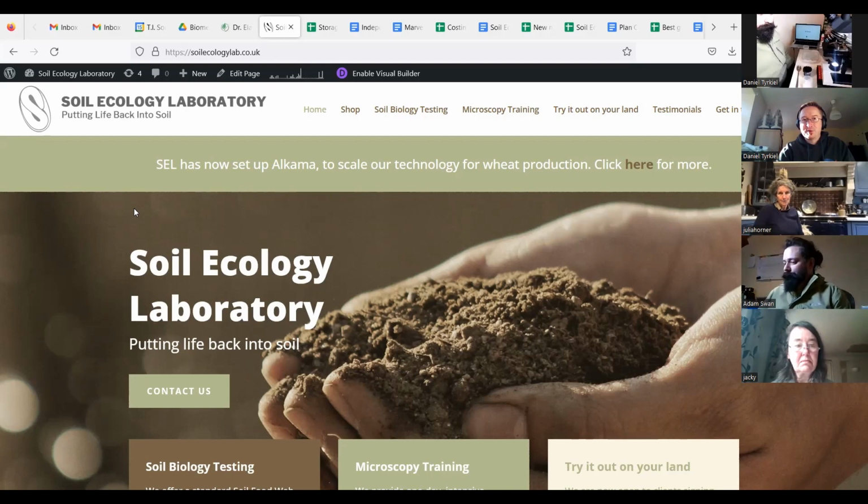It's still a good tool for everybody to quickly assess what's in their soils and compost. The method itself can be used in a scientific manner if you adhere to replication practices. If you take simply a single sample and a single drop from a sample and just look at that, then obviously you're only looking at a very small fraction of the volume of the soil or compost.